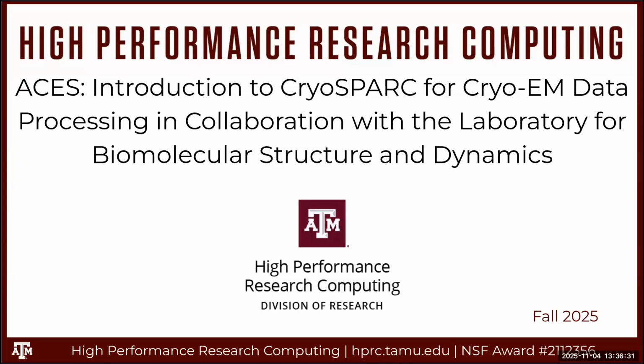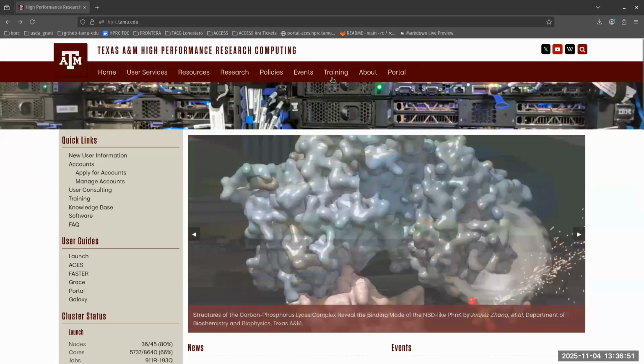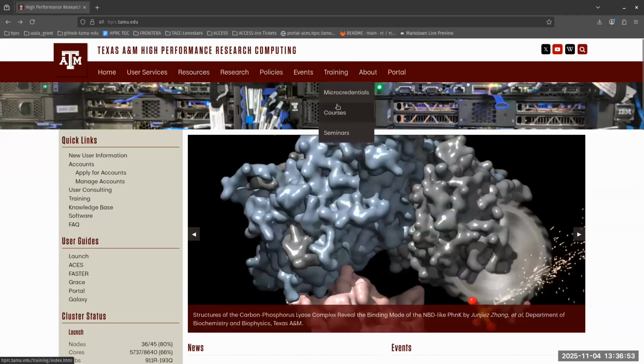And today I'm going to show you how to access CryoSPARC on the ACES cluster. And also we'll have a detailed demonstration which you can follow along. If you have any questions at any time, you're welcome to unmute yourself or ask in the chat. We have a number of staff on hand that can help you with that.